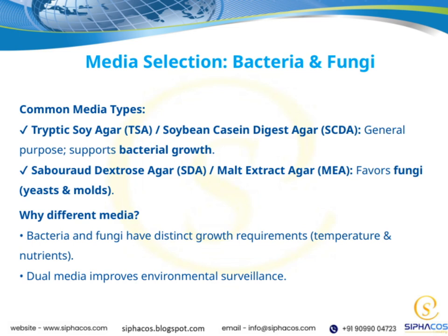On the other hand, fungi, including yeasts and molds, require different conditions. That's where media like Sabouraud dextrose agar, SDA, and malt extract agar, MEA, come into play. These are formulated to favor fungal growth, providing the right nutrients and pH to support their development.